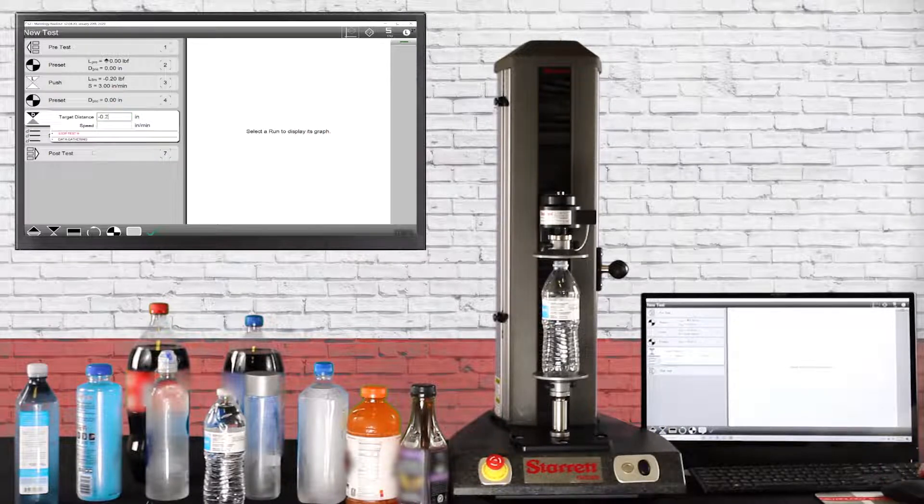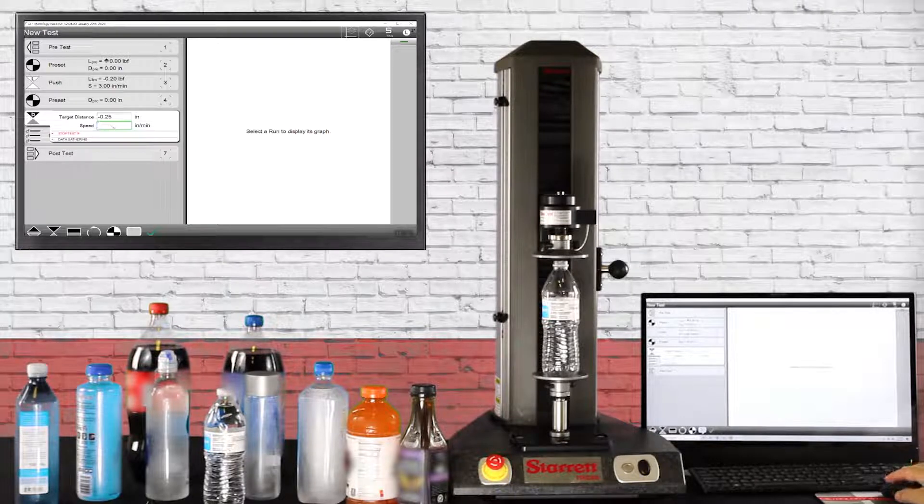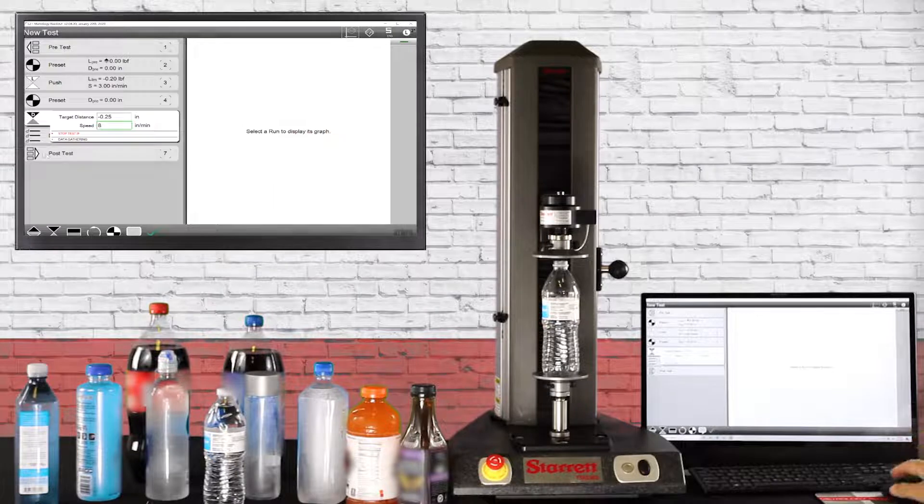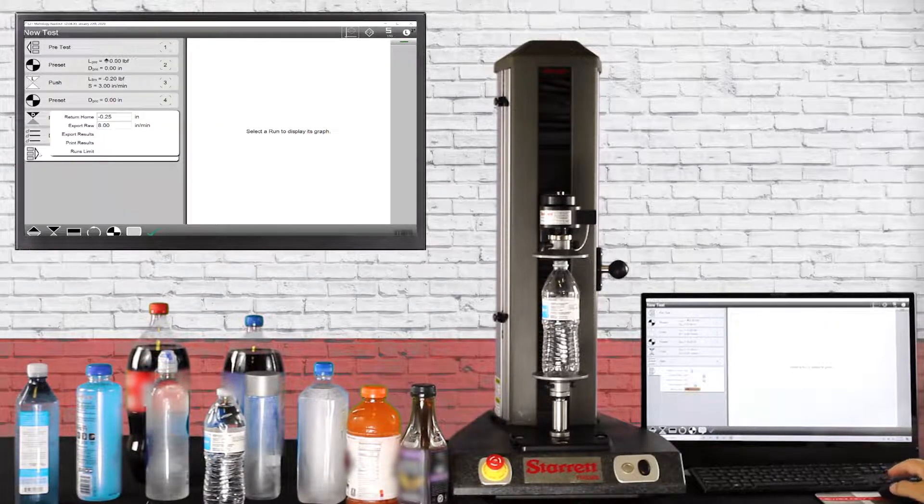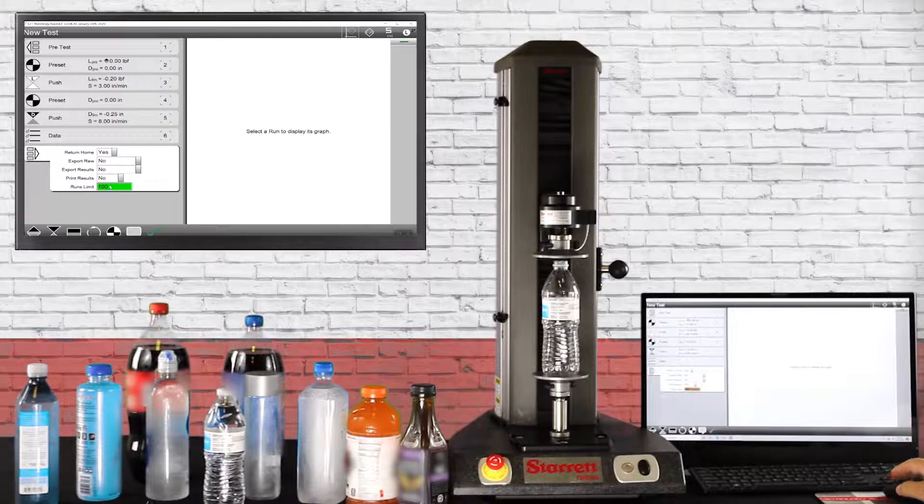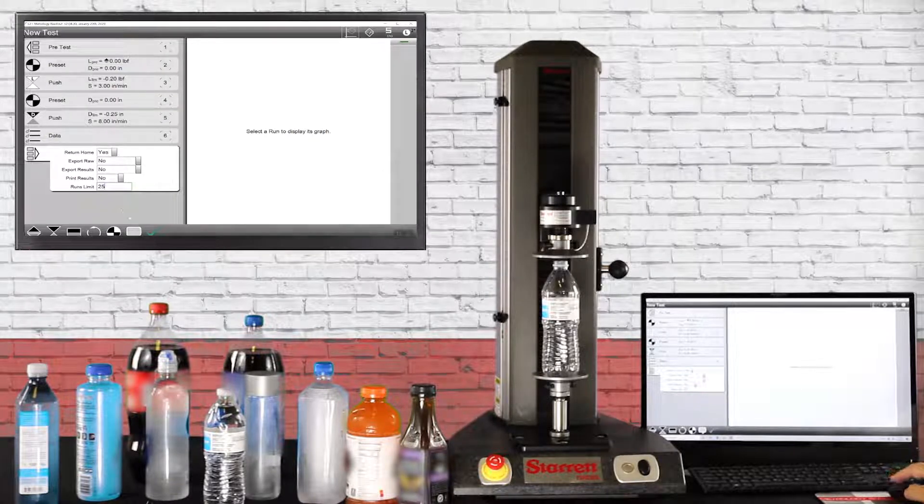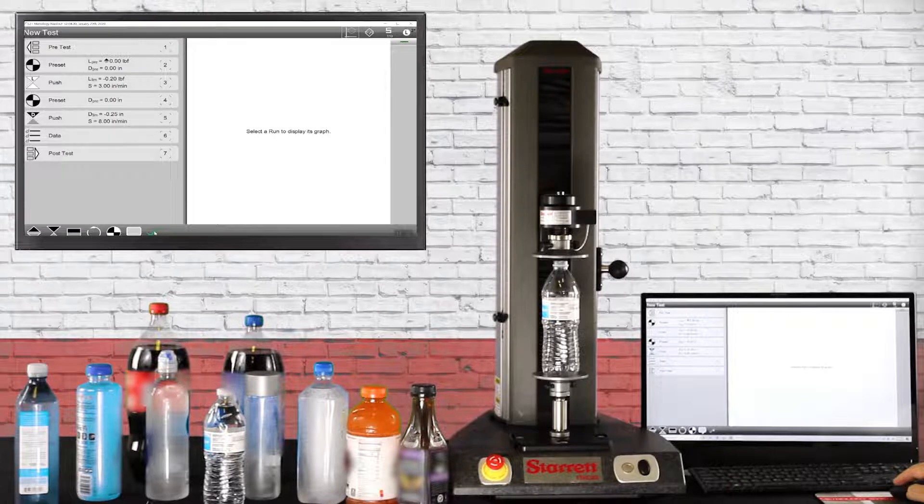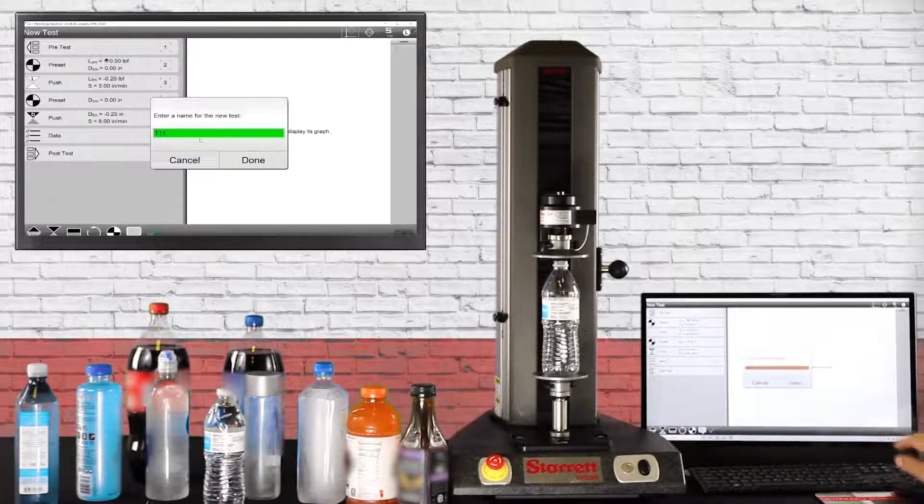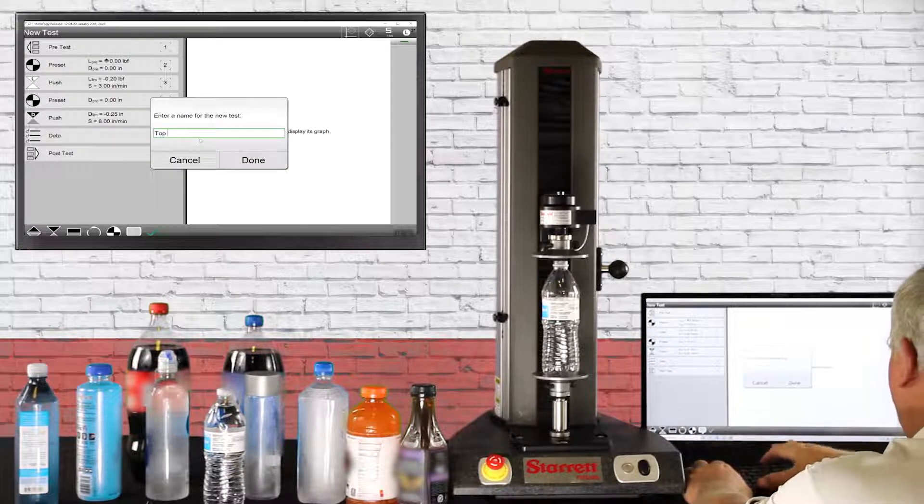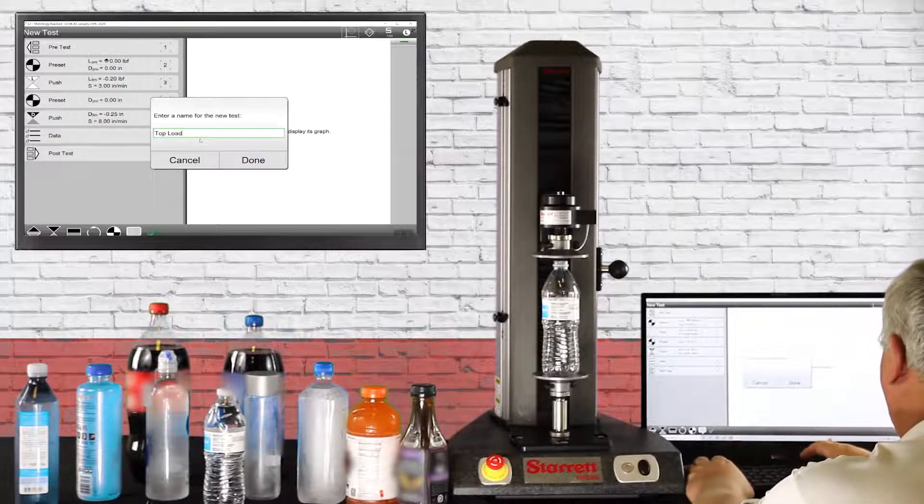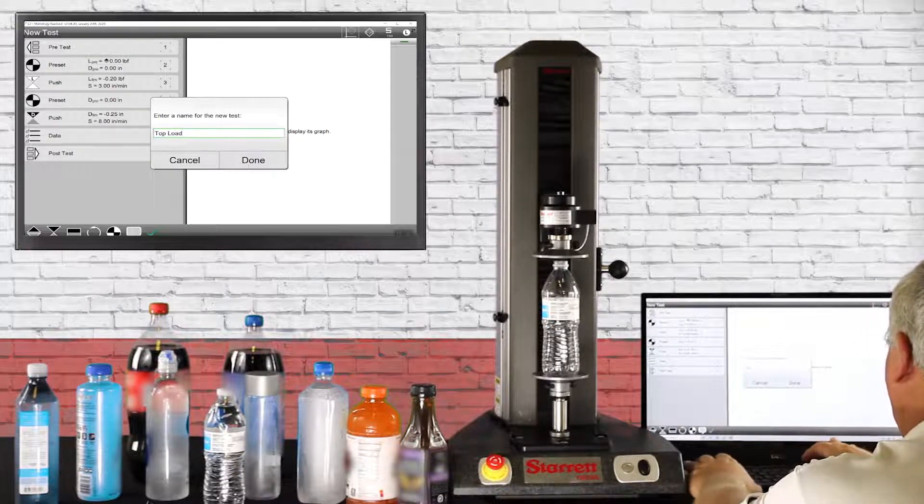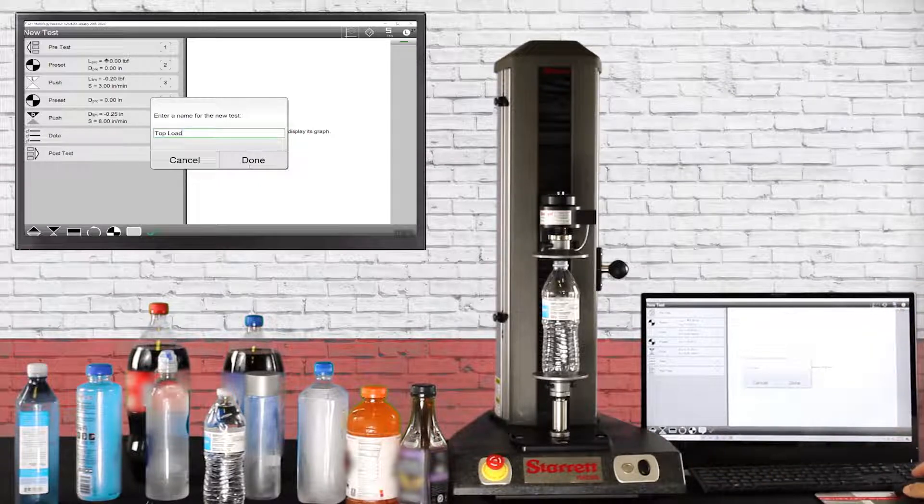Next is the post test, we're going to have a return home, and we're only going to put 25 runs on the screen. We hit the green check, hit the green check again, click save. Now you'll type in top load, back out of the screen, and hit done.